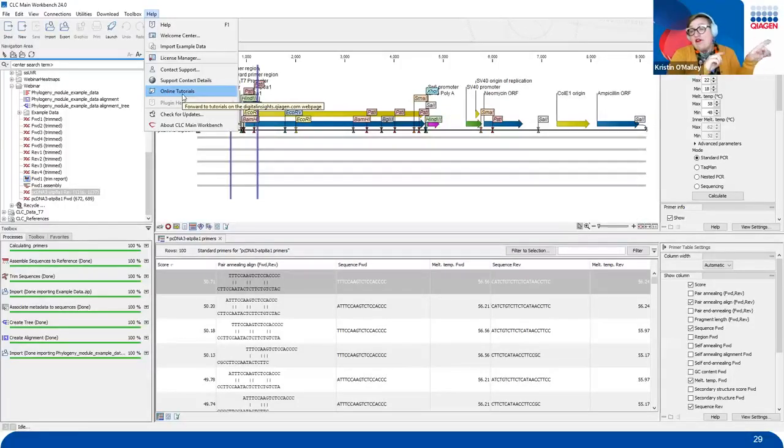At the beginning of my slide deck that you guys should have, I actually linked to all these tutorials as well. And the other handy bit about this is it will point you to where to grab example data from. So you can practice without having to mess around with your own data here as well.